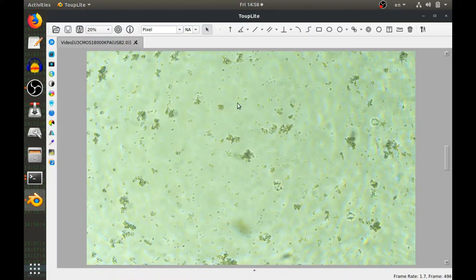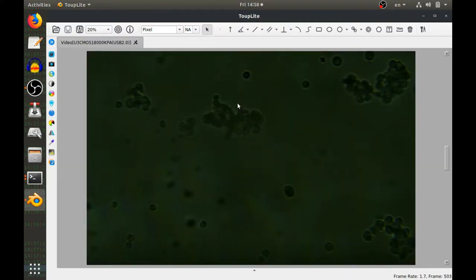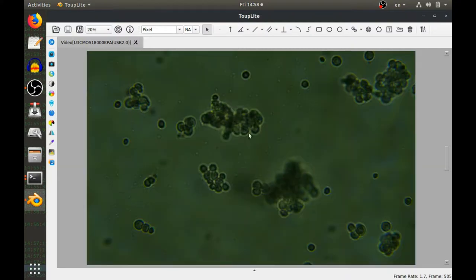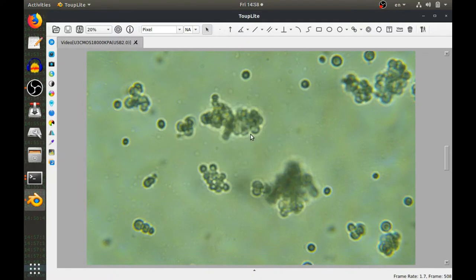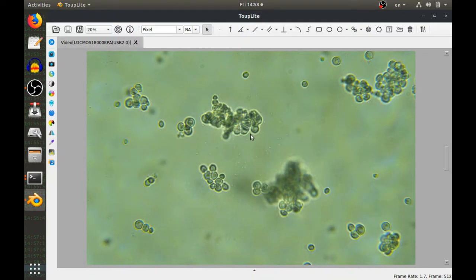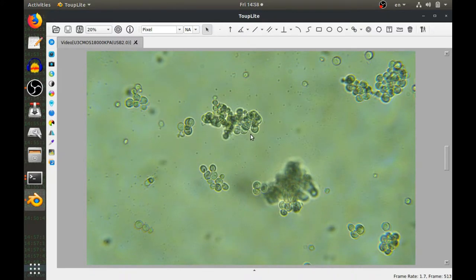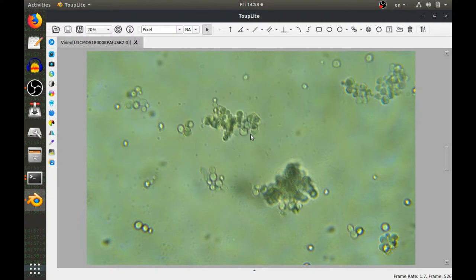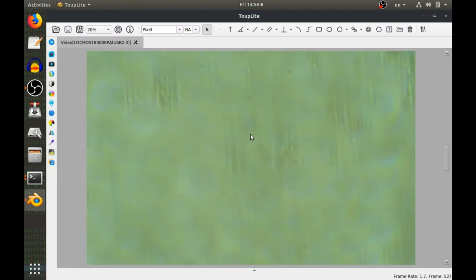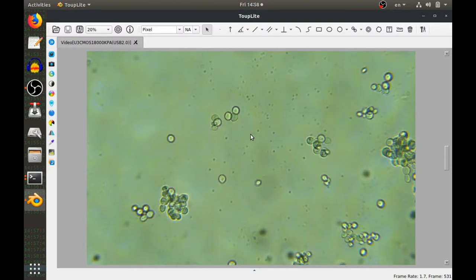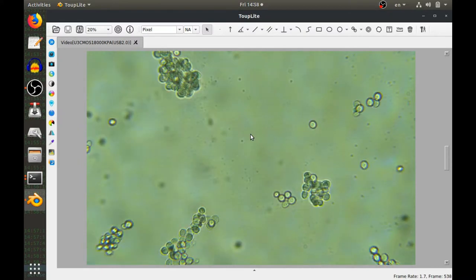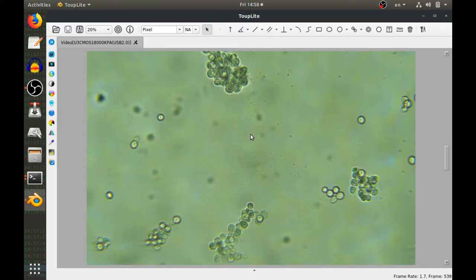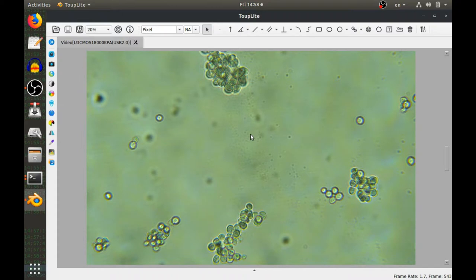They look a little bit boring, but that's fine. Higher magnification, 400 times. It is a bit of a delay and focusing is challenging, but moving is not a problem as long as they're all focused. That should be easy. Now there is a green filter which I have off, actually I have it out, but the picture is still sort of greenish and I need to look into fixing that.